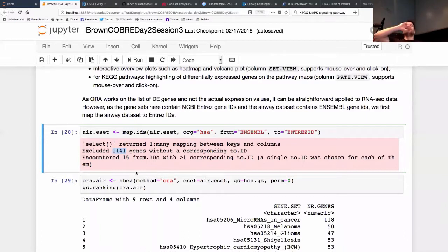Yes, please. So what happens with genes? Because when you run this, you also get matrix selected like this, which I guess is another way to switch. I also use this get matrix with selected IDs, which changes from whatever you want to gene IDs, but you always lose some. They are lost because they are not reported or not important. All kinds of reasons. Not coding. All kinds of reasons. There is unfortunately no trivial, easy solution to gene identifier mapping.